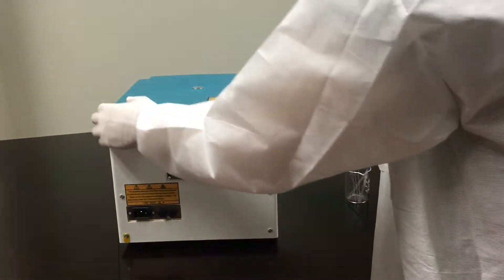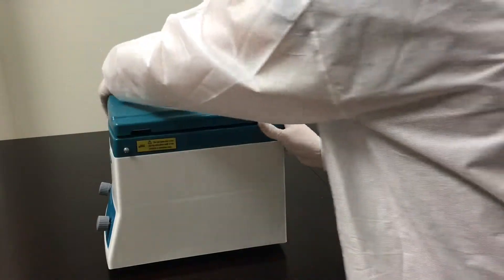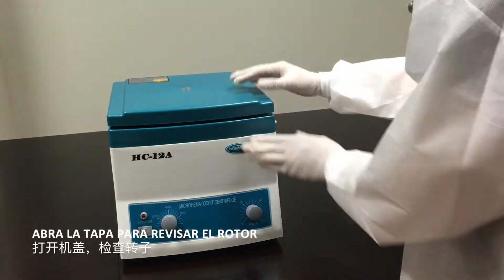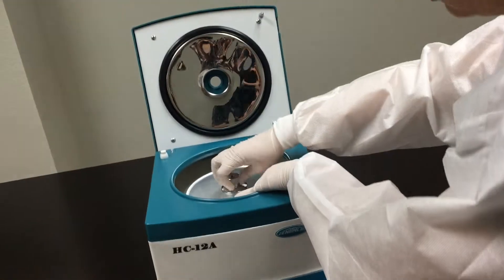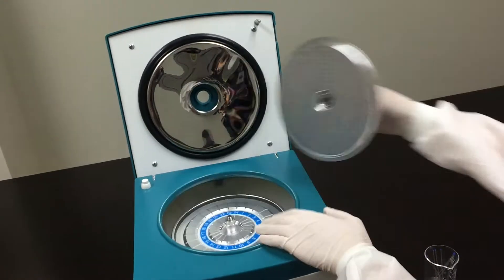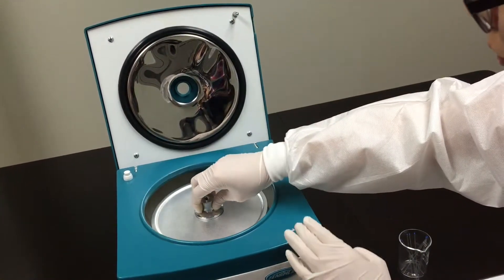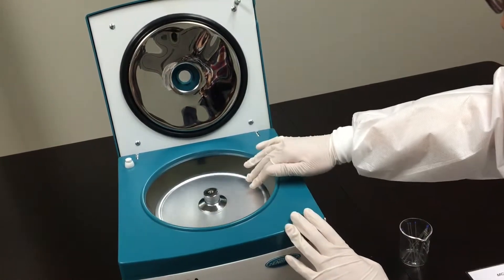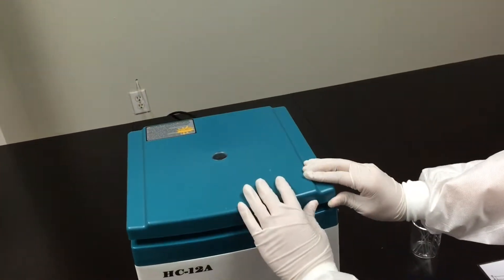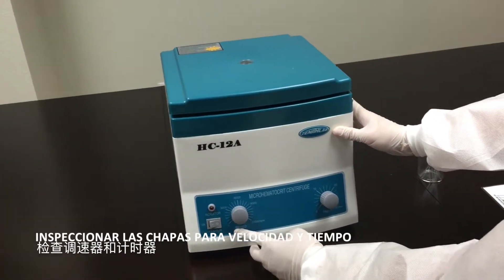Ensure to inspect equipment. Open the lid to revise the rotor. Inspect the knobs for speed and time for any damages.